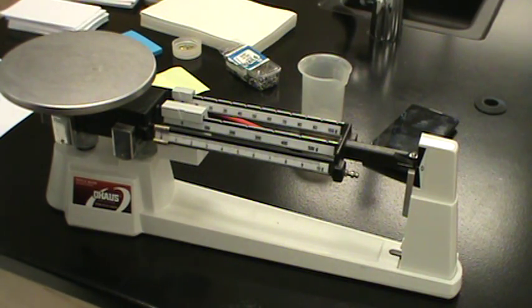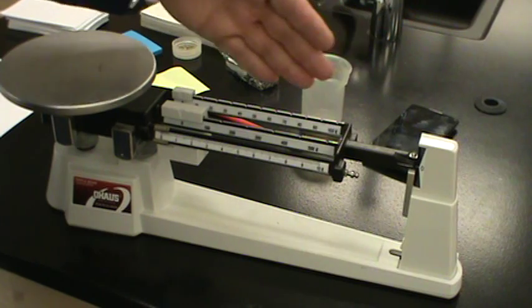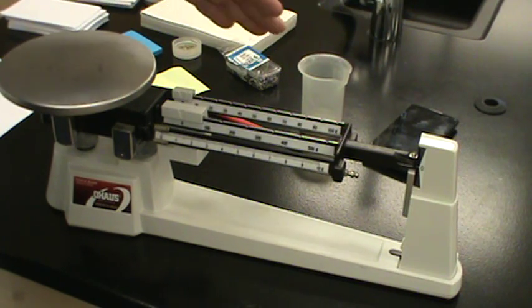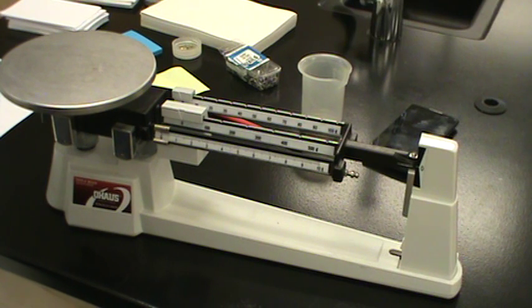Why is the heaviest one in the middle? Well, one of the students asked that the other day. The idea is to keep most of the weight on the middle line so that it's not lopsided and it will weigh more accurately, or it will measure more accurately.